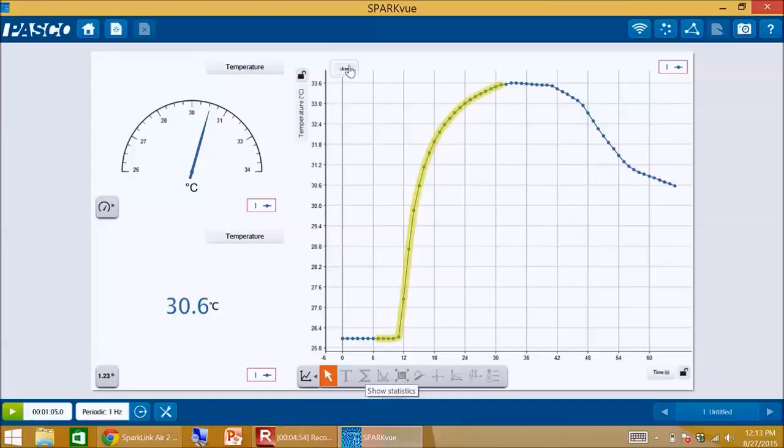Very important, you have to click on this Done button. Otherwise, it doesn't know that you're actually happy with your selection. Like maybe I'm not happy with my selection. Maybe I say, oh, I really want it to look more like this. And now I'm happy with my selection. Done.